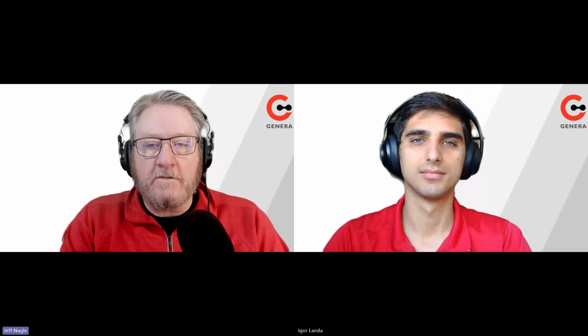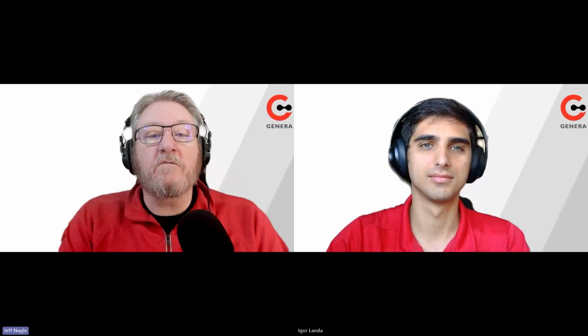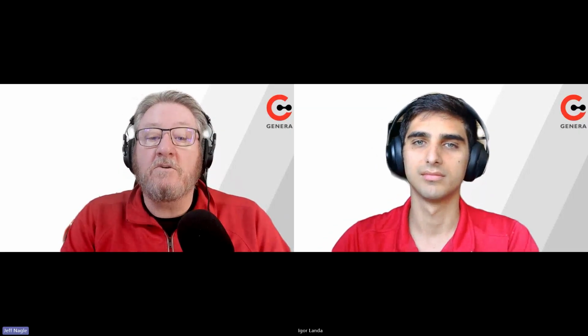So you got Genera installed. Now what? In this episode of Genera Gems, we're going to move through the process of getting further down the road on what Genera needs to become fully operational based on instruments that are installed and the workspace you need. All on this part 2 of Genera, Zero to Hero.